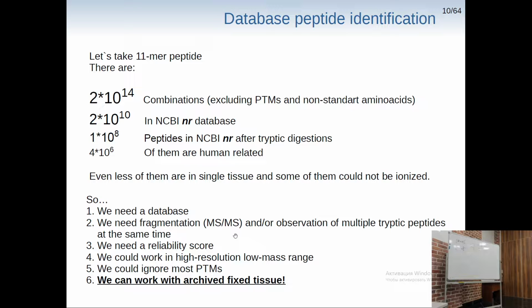First, we have some glycosylations. Usually, after fragmentation, those glycosylations will also fragment off our peptide. And if you have a really long protein, what do you think? Is there a chance that every serine is phosphorylated here, for instance? No. So we'll still be able to find some information even for a highly post-translationally modified protein, because there will be peptides which will be the same even if our proteins are naturally post-translationally modified, because not every amino acid here is modified.